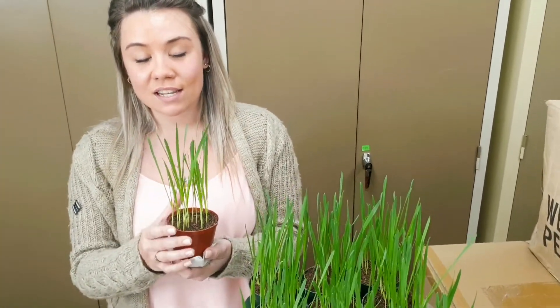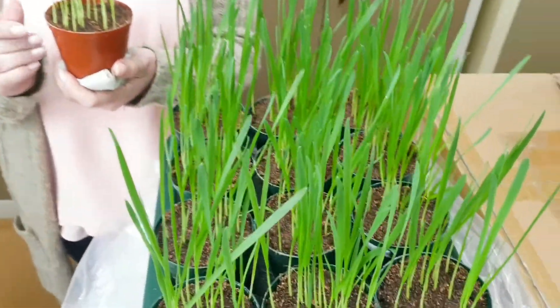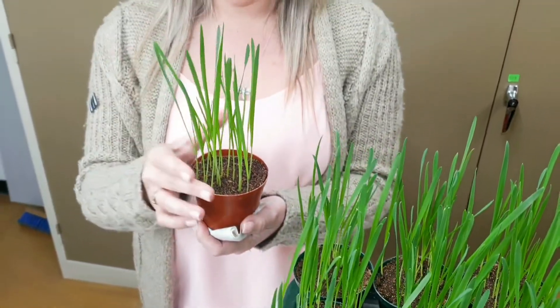What I'm planning to do with these plants is infect them next week, when they are three weeks old, with the bacteria Pseudomonas coronafaciens. For now, as you can see, these plants are still very healthy and growing nicely.